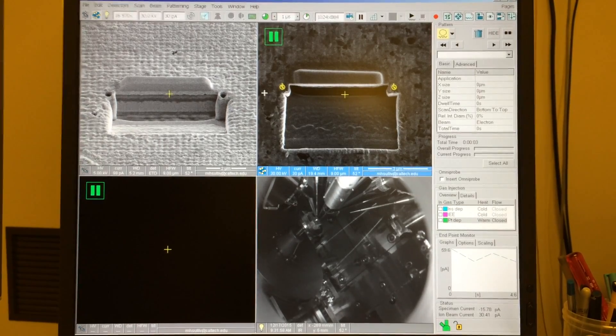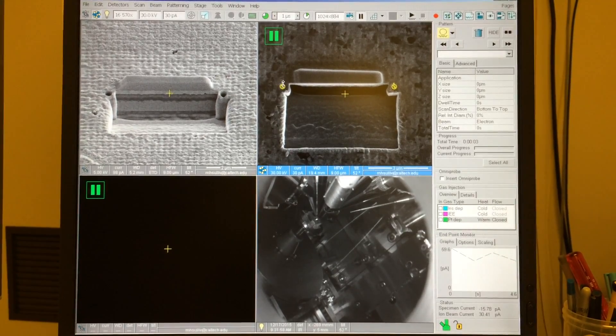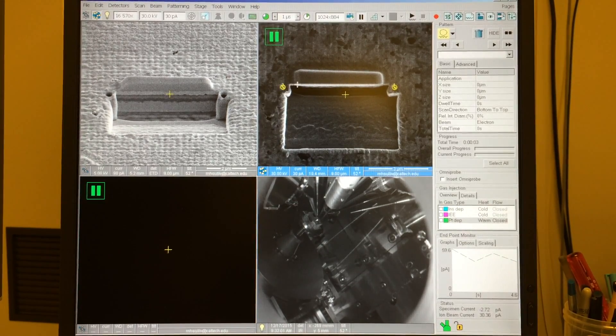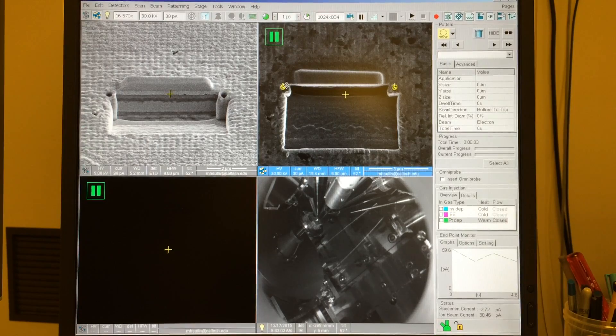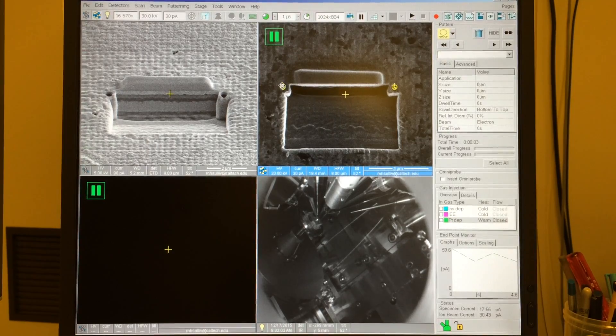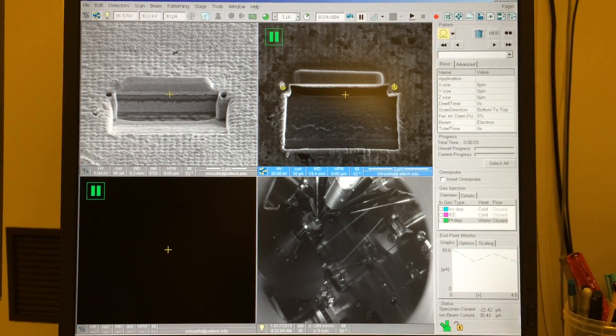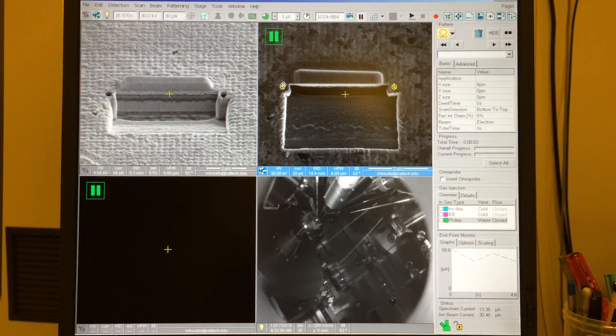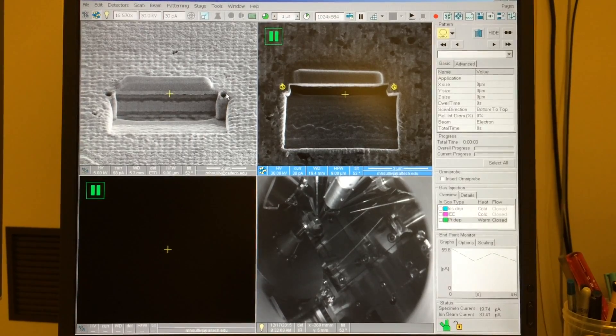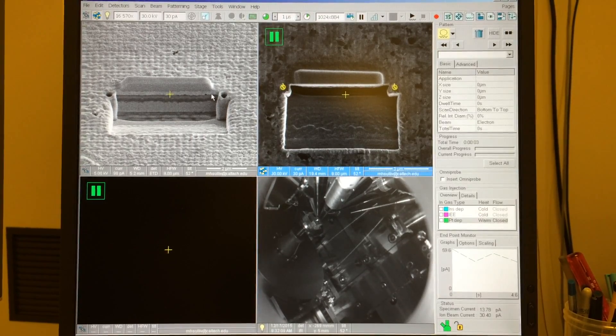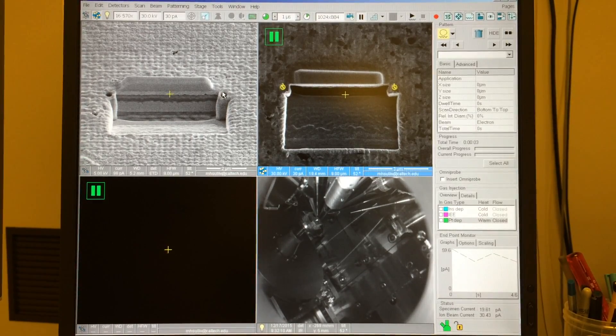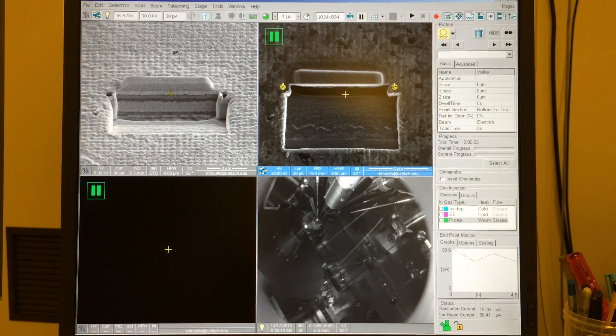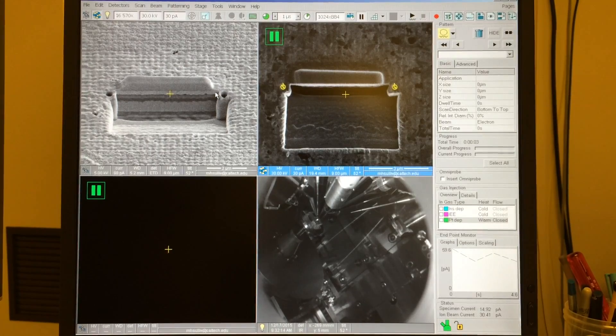And I put them so that the back end of the circle is in line with the cross-section face so that if we focus on the back of that circle, the little cross-section that it mills, we'll be able to be at the same approximate focal distance as the area of interest on our surface.